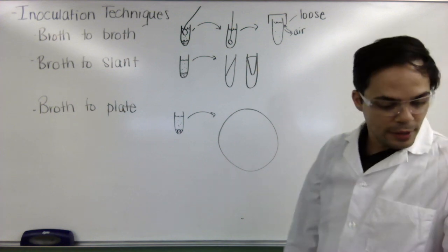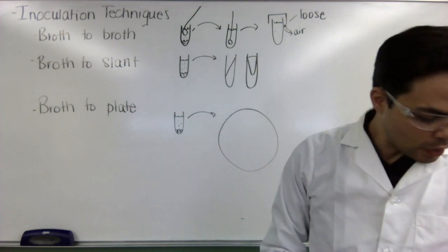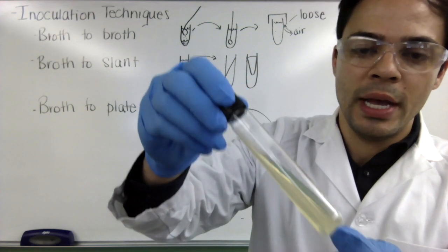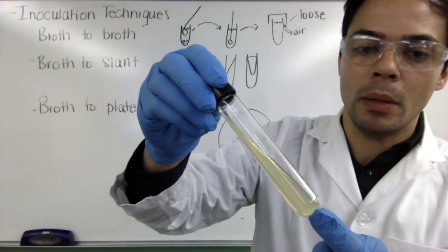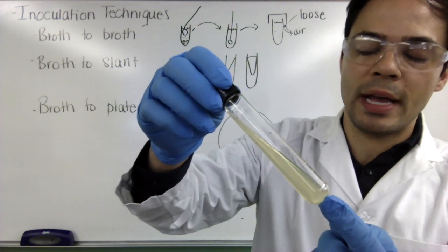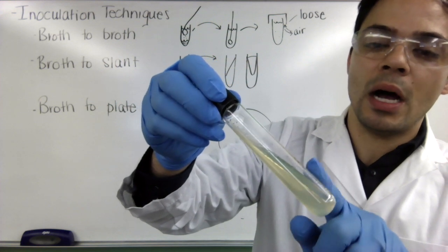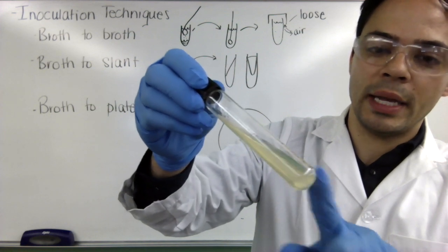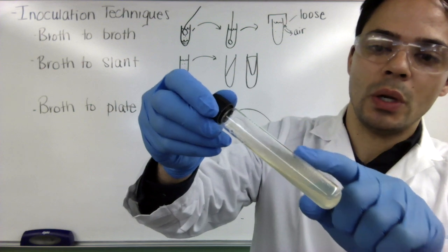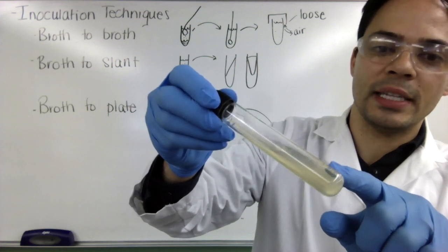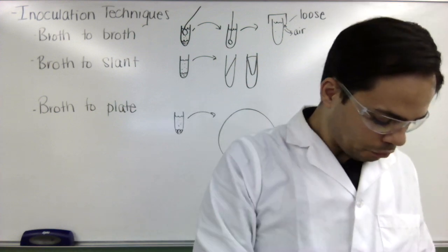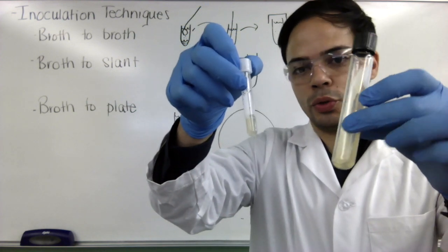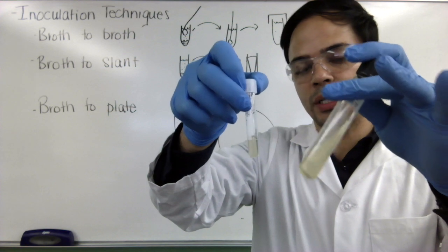The only exception is if you're growing a strict anaerobic, in which case you would close the tube all the way. But the bacteria we're working with here do need oxygen and need to respire, so we're going to leave the caps loose. The next one is from broth to slant. Here's an un-inoculated nutrient agar slant. It has the same formulation as the nutrient broth except it has agar in it, which causes the medium to form a jello-like consistency. That provides a surface onto which bacteria can grow on that slant portion.